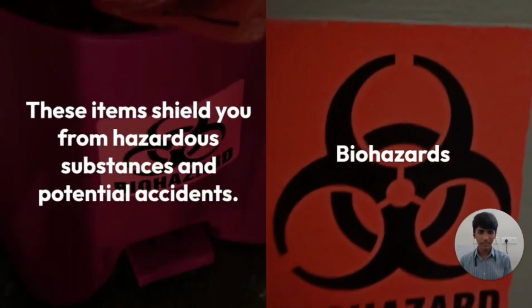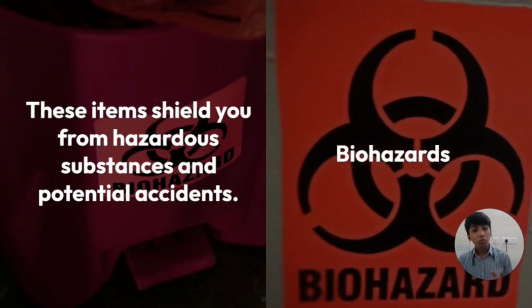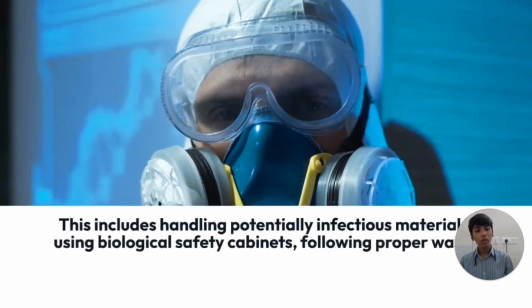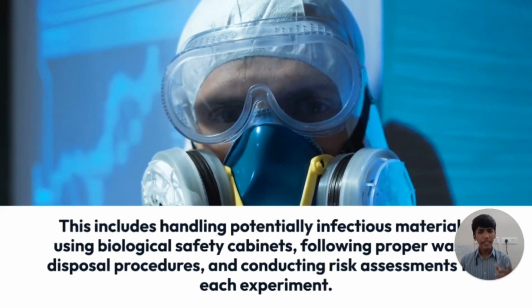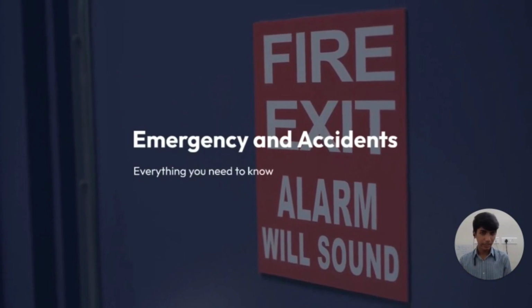Now we will look at hazards. Hazards may be biohazards or chemical hazards. Biohazards are more dangerous since they infect from host to host. So while handling a biohazard, or any kind of hazard, you should handle it in a safety cabinet only. Otherwise, you will get infected.